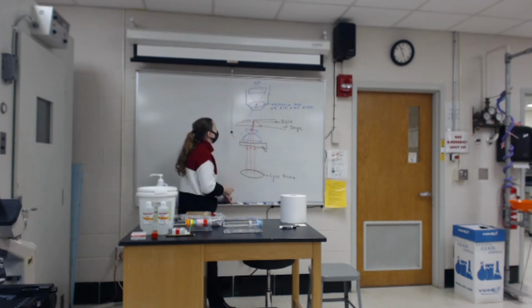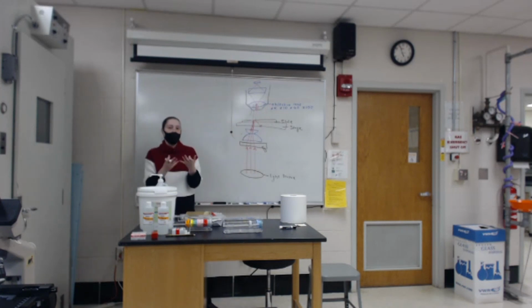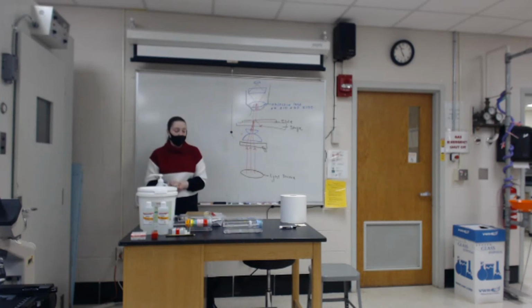And so the light is going to be directed straight into the lens rather than being backed away. So that's one of the reasons why we use oil. It prevents that refraction of light, and it funnels it into the lens.